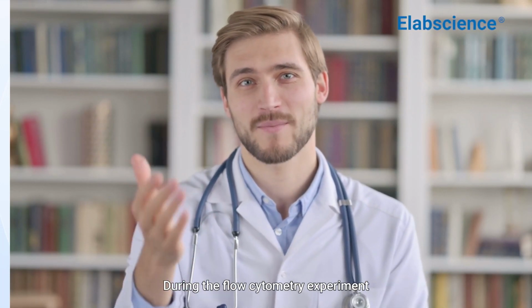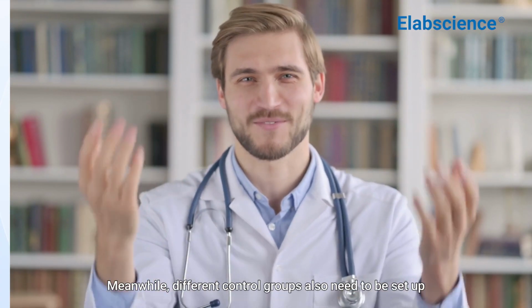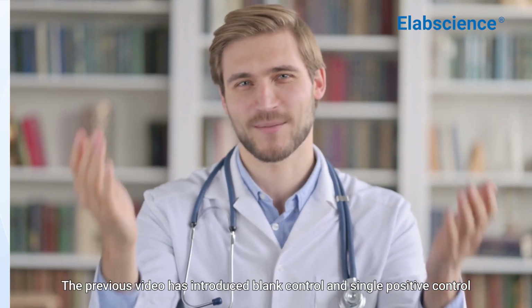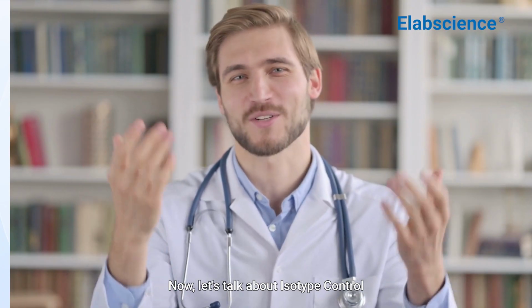During the flow cytometry experiment, we need to prepare the test sample. Meanwhile, different control groups also need to be set up. The previous video has introduced blank control and single positive control. Now, let's talk about isotype control.